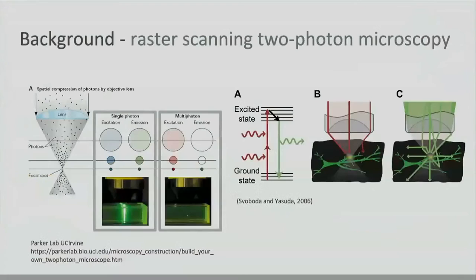So in our lab, we use two-photon microscopy. It's a type of fluorescent microscopy that uniquely has advantages for in vivo imaging, allowing you to use fluorescent biosensors to measure neuronal activity within living animals to see better how neurons compute information by measuring proxies for neural activity like calcium levels using genetically encoded biosensors like GCaMP, or using iGluSnFR to measure neurotransmitter release across a neuron.